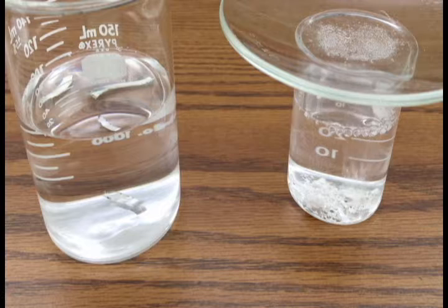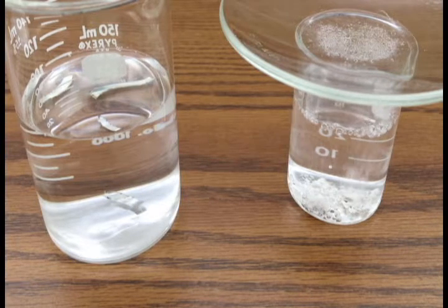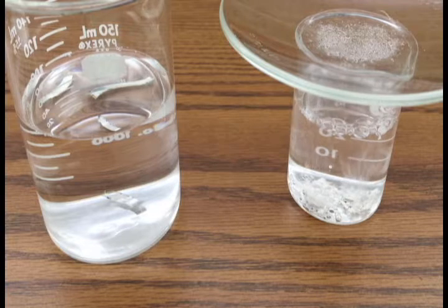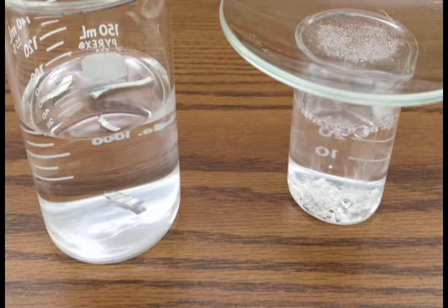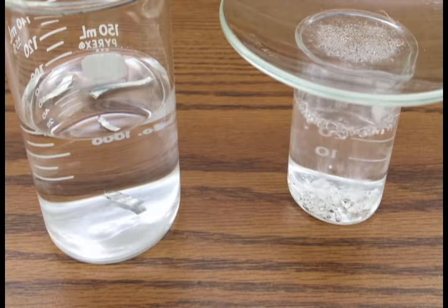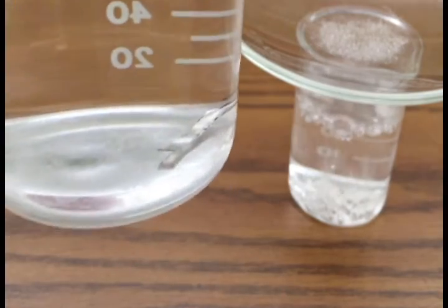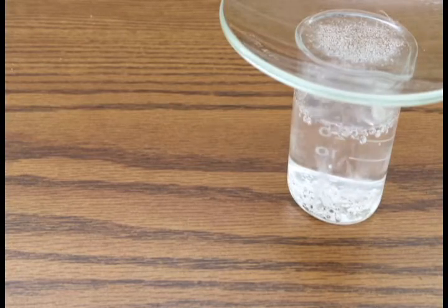period. It has to do with the location of the magnesium on the periodic table. So we will let this reaction continue with the calcium, and you should be able to see it is bubbling very, very rapidly. Look closely at the magnesium, and nothing appears to happen.